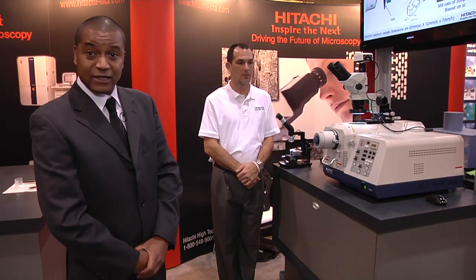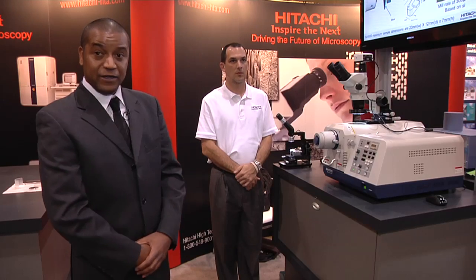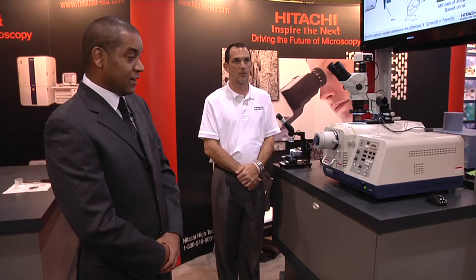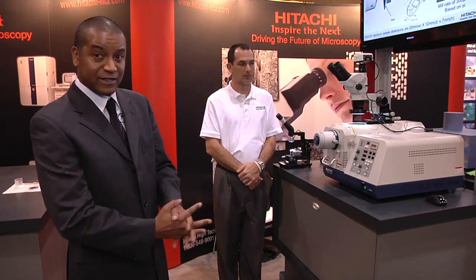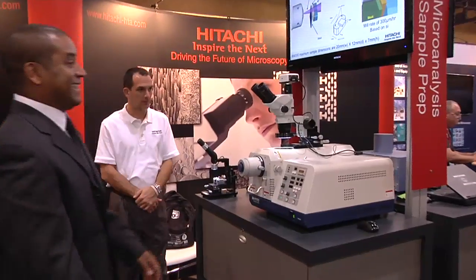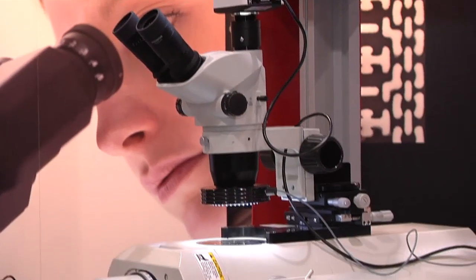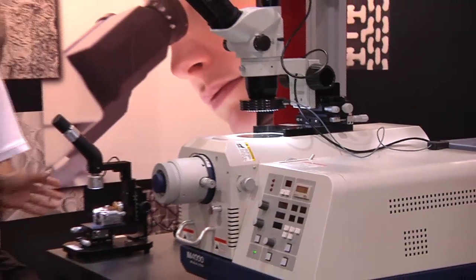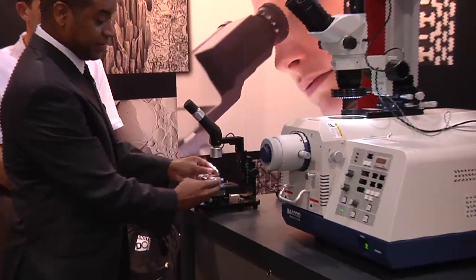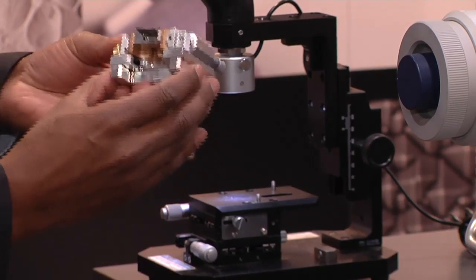It also includes a mass flow controller to regulate the pressure, and a turbo molecular pump to improve the milling performance for preparing your samples. By using the IM4000 in conjunction with other mechanical-based preparations, you can improve the yield and quality of your sample surface milling. We also have an optical scope that can be mounted on top with a CCD camera, so you can observe and determine the extent of the mill while it's in the chamber. While pumping down, we can see through the smaller optical scope on the side, which has our cross-section assembly — we can pinpoint our target well within 10 microns and adjust that, then take the entire assembly and load it into the IM4000.